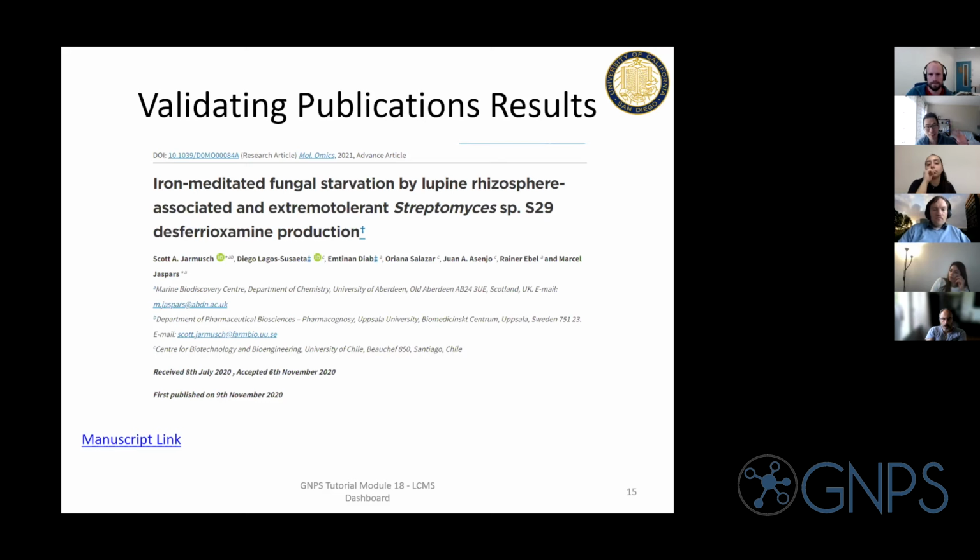I'm going to stop there. Hi, sorry, Ming. Yes. Hi, there's a very interesting question in the chat. It's not from me, but I think it's important. Let me pull it up to answer. Yeah. Thank you. Is there a limit to the number of files added for comparison? That is a good question. So yes, generally we limit it to 100.